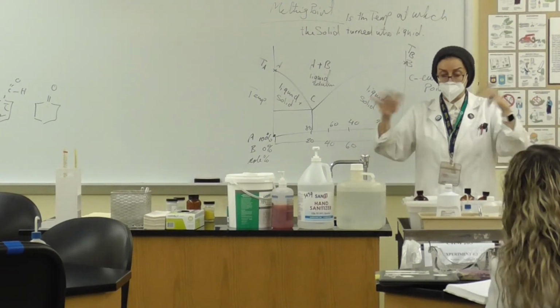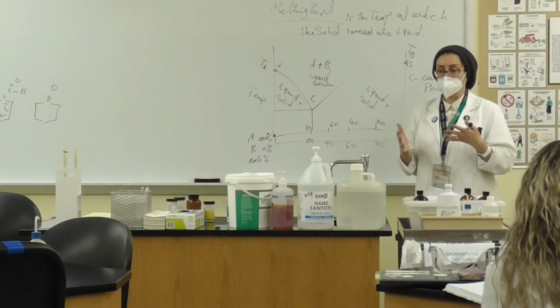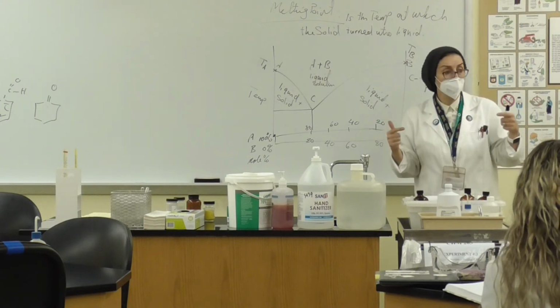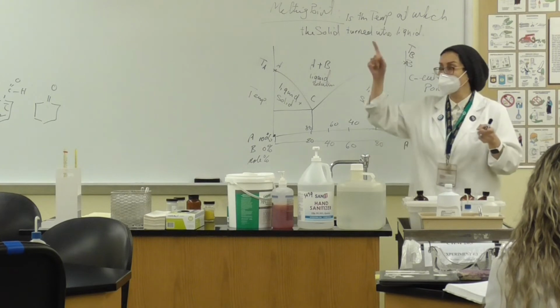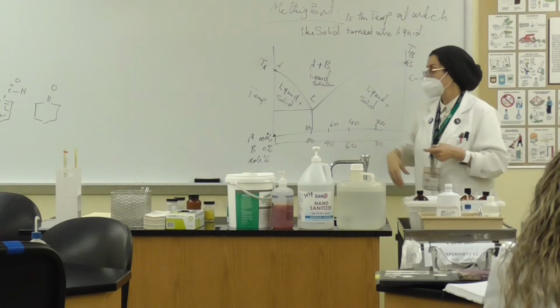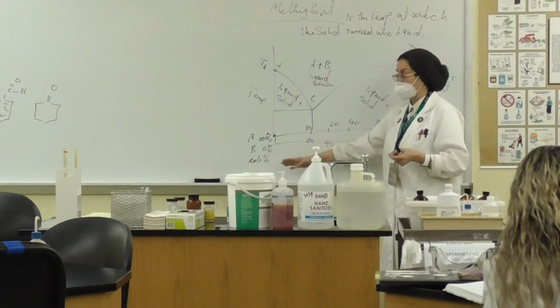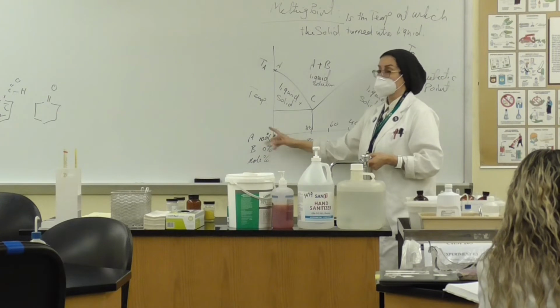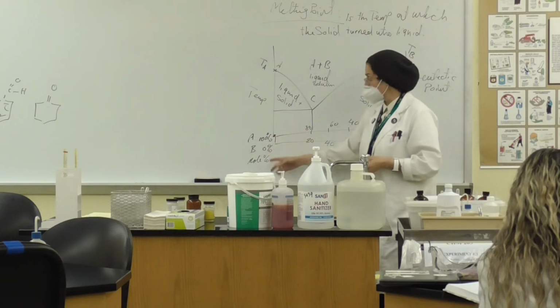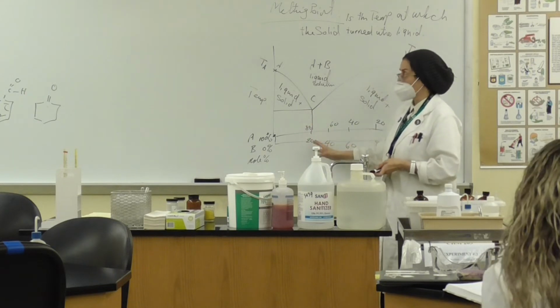Because when we have more than one, or what we call an impurity, then we are going to have a long range between the solid and the liquid when it is going to melt all of it. But when we have this kind of mixture, at the beginning we have 100% of the A chemicals, 0% of the B chemicals, as we go through.